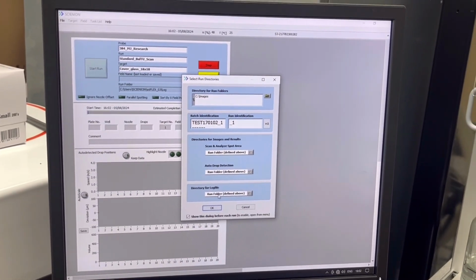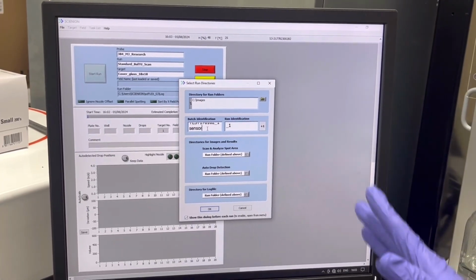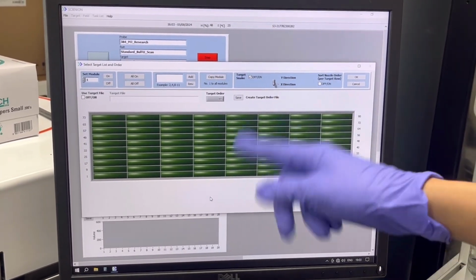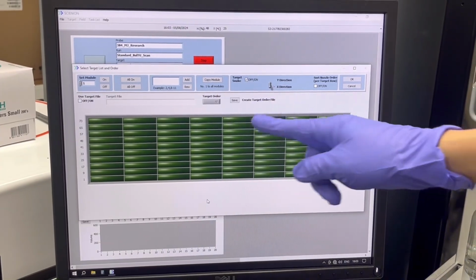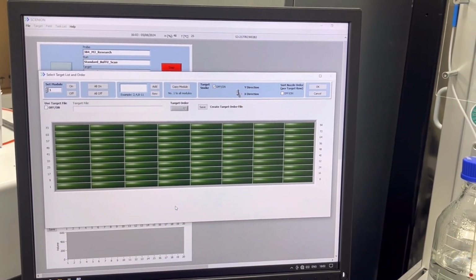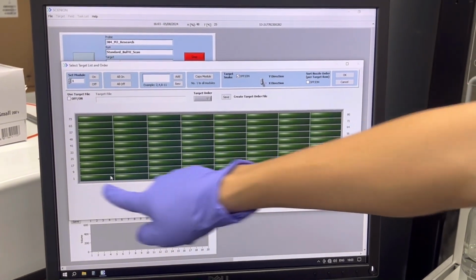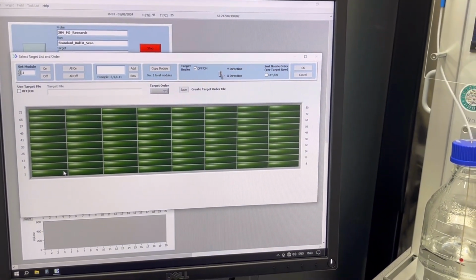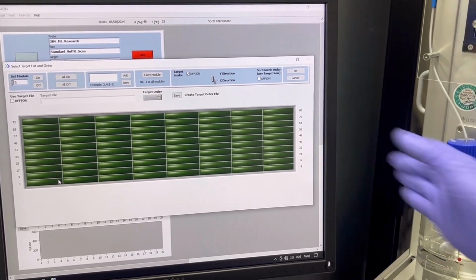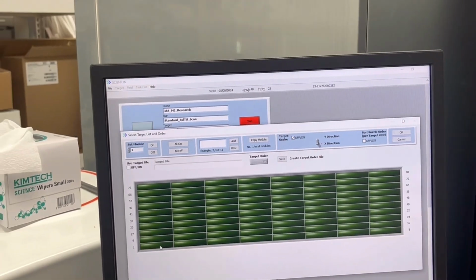In here, we can modify the name of the file we will save. Okay, and here it corresponds to the white plate, the whole one. And this one is the x-axis. Yeah, this one is softer, right? But the y-axis is quite different. Yeah, but we have to understand.